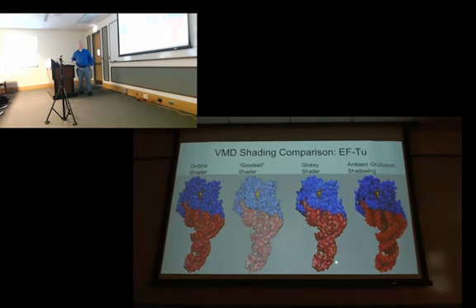Then you, of course, have your typical glossy shaders, and then your ambient occlusion lighting with it, sort of a chalky material. So this looks more like something made out of rubber, like a pencil eraser or a piece of chalk. And if you look at the different things, this one is showing, you can see the interior is darkened because the light is blocked, and that's something you don't see in the others. And this one looks more flat. You de-emphasize the 3D structure. It's just sort of there. It takes up space. And then the others have their own appearance.